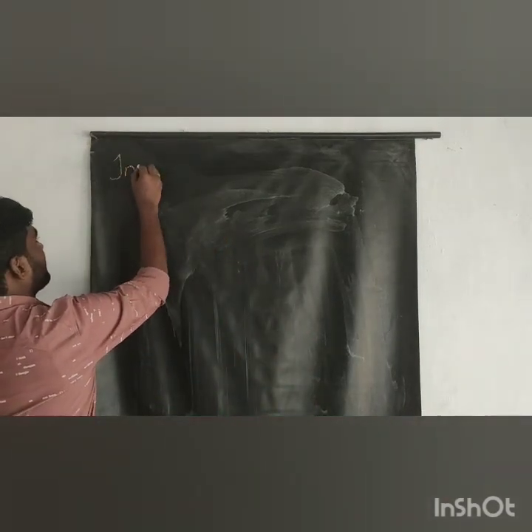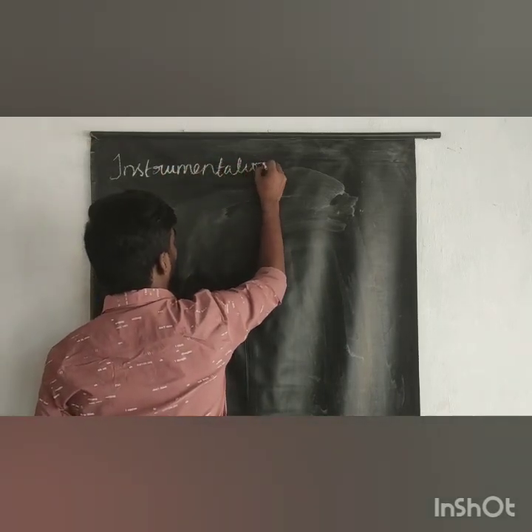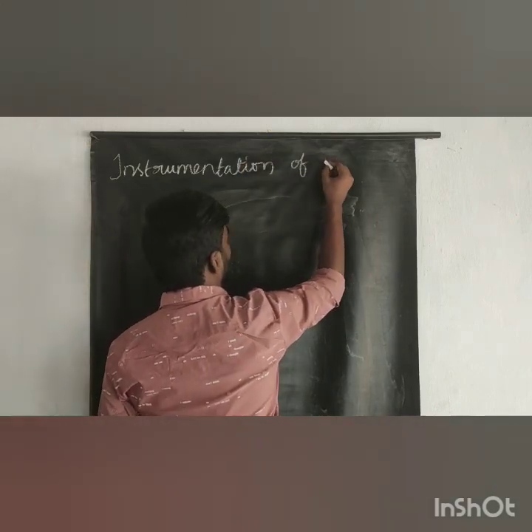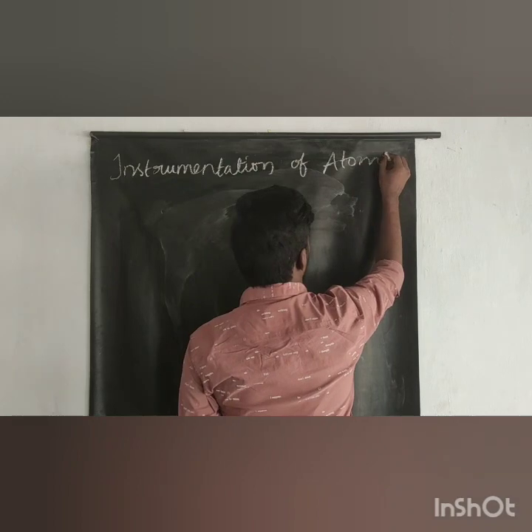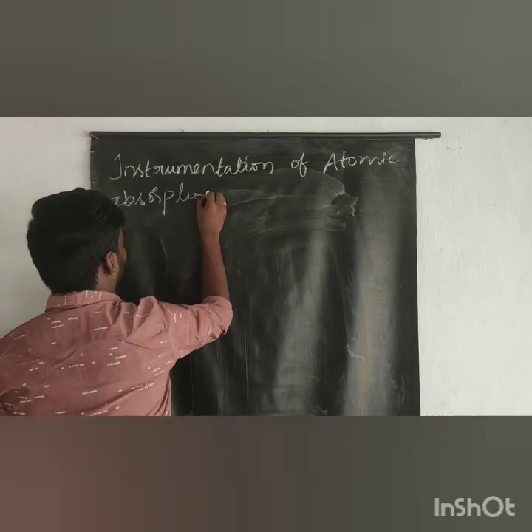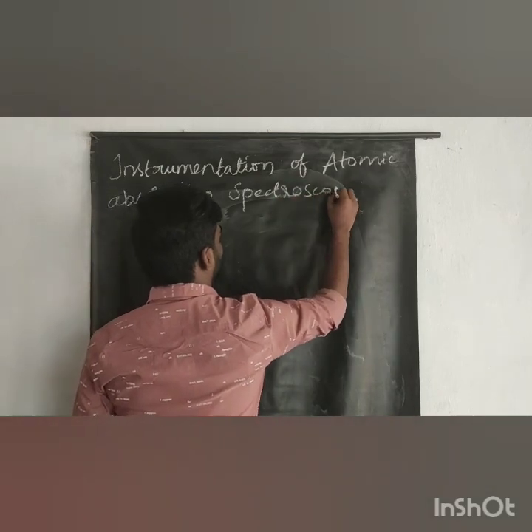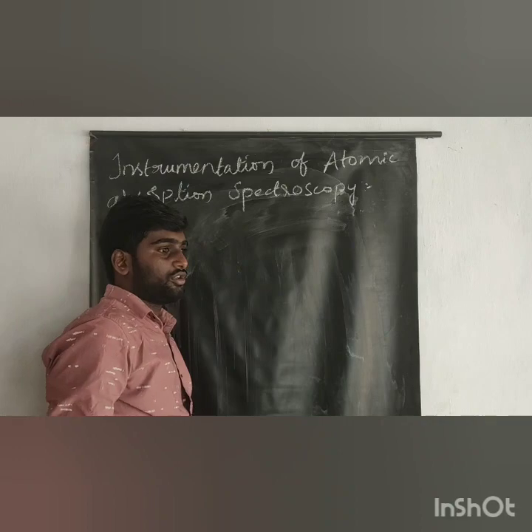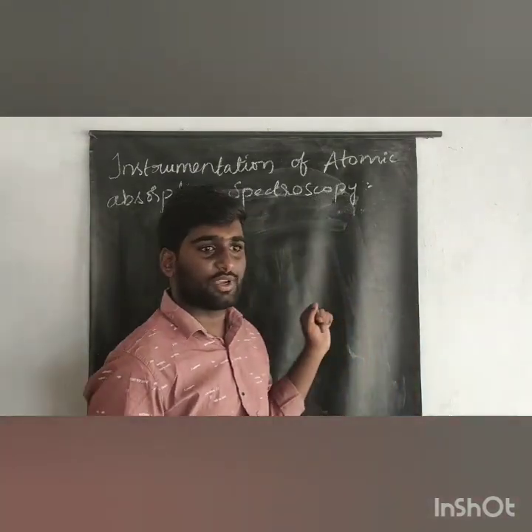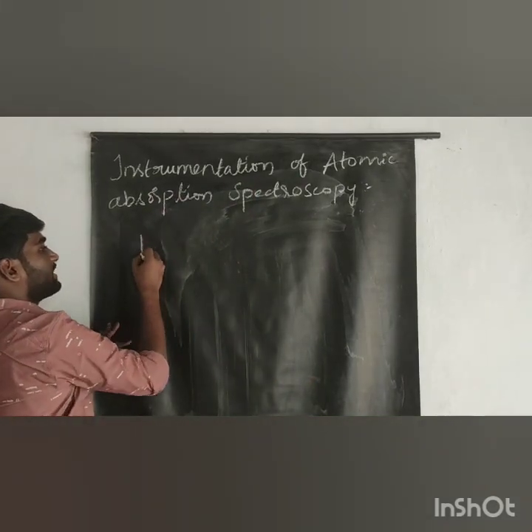So today I am going to teach about the instrumentation of atomic absorption spectroscopy. So what is the instrumentation of atomic absorption spectroscopy? See once the diagram of the instrumentation of atomic absorption spectroscopy.